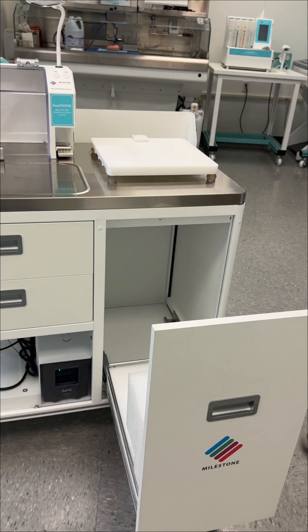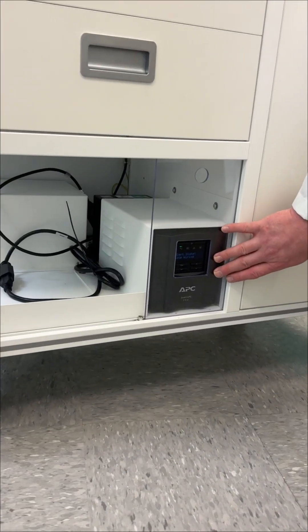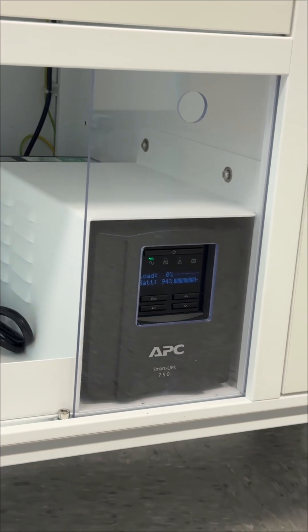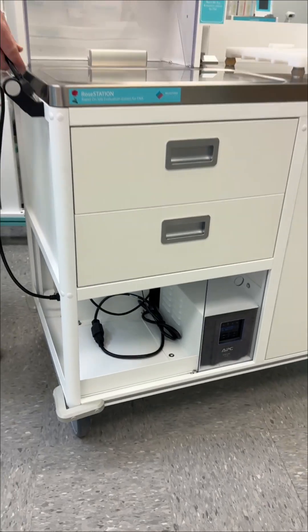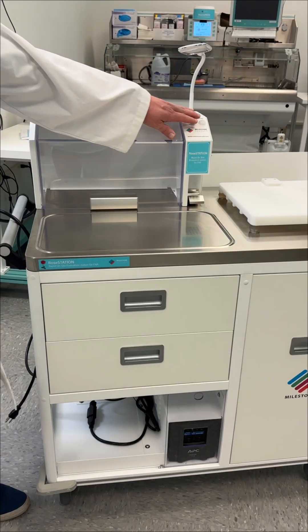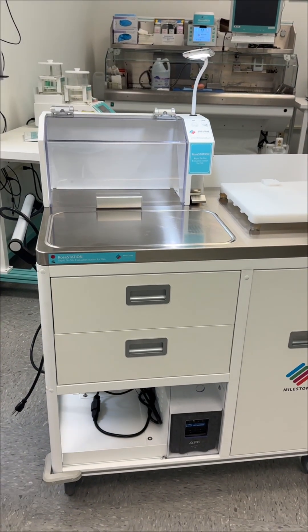The unit also includes a small UPS for onboard power. This provides up to a couple hours of working time without needing to plug into a wall outlet. That makes it especially useful when moving into hospital rooms since you are not tied to where outlets are located. The UPS ensures full functionality of the unit on the go.